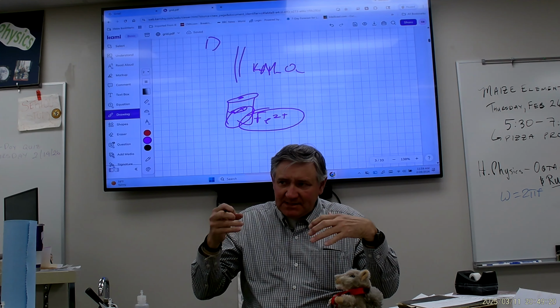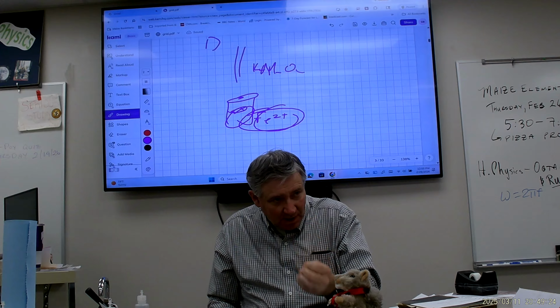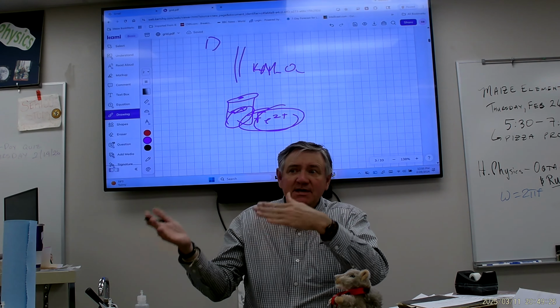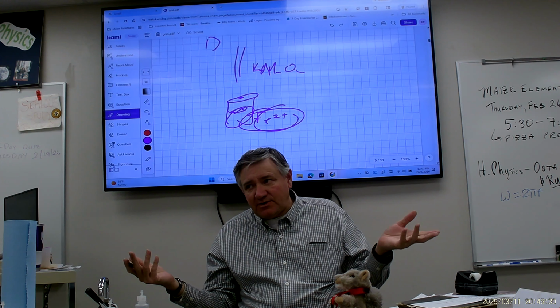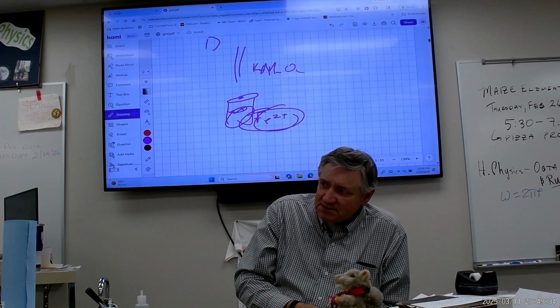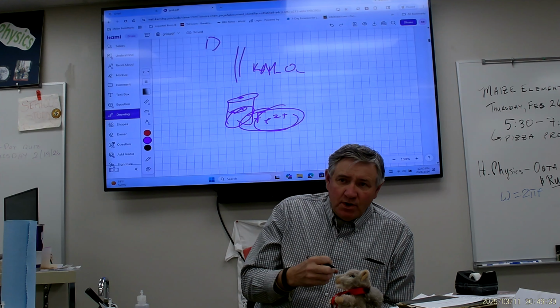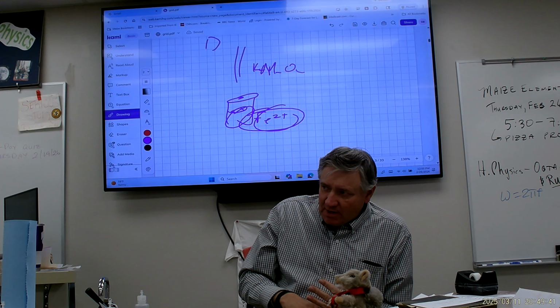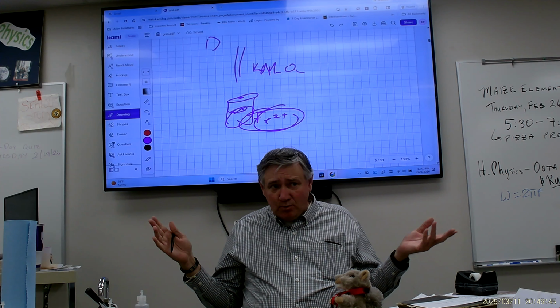So what happened is that you reached a point where all the Fe2+ had been used up, then it just remained purple because the MnO4 had a distinctive color. So that's one of the unique situations we can do this because the MnO4 has such a distinctive color. We couldn't do this with like sodium hydroxide and hydrochloric acid because everything looks like water.